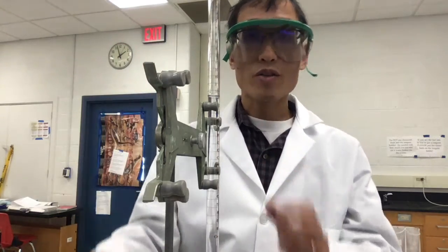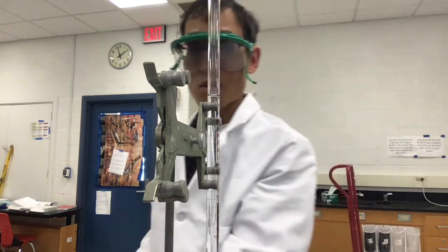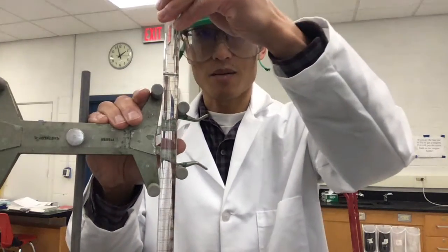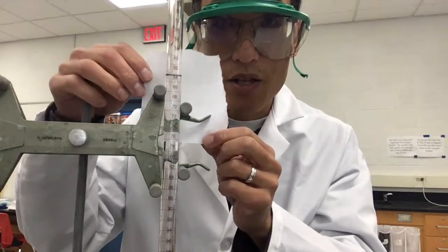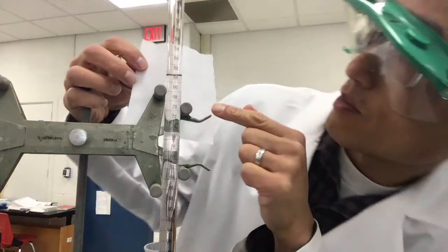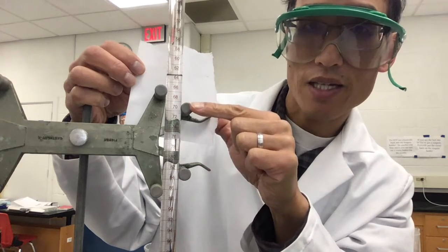And then we have to read the Buret. So reading the Buret, if you look at the numbers here, let me see if I can set this up. If you notice, the numbers go backwards. So I have 62, 64, 66, 68, 70.